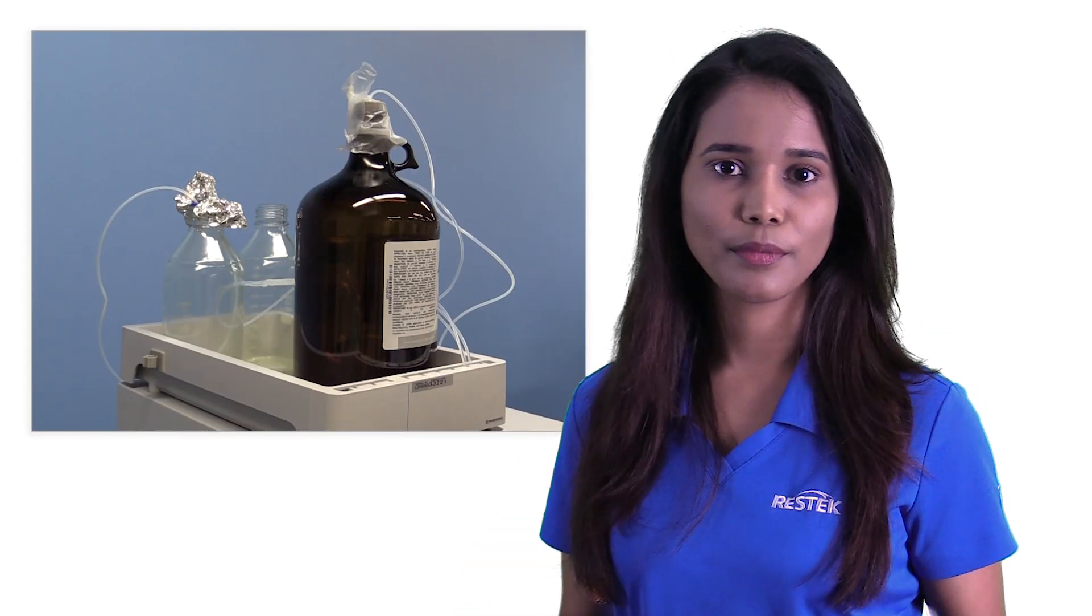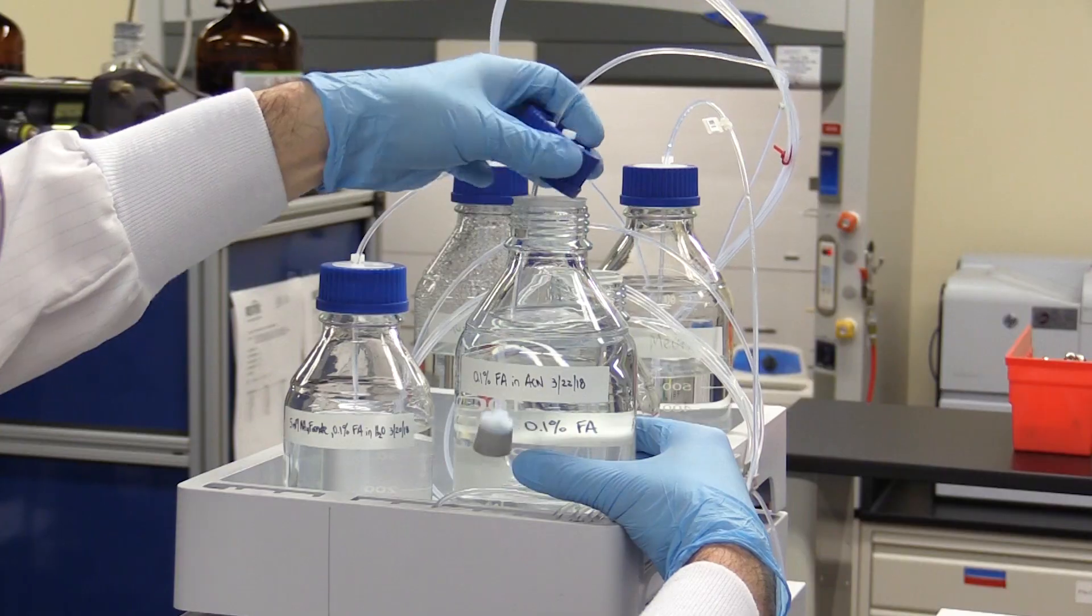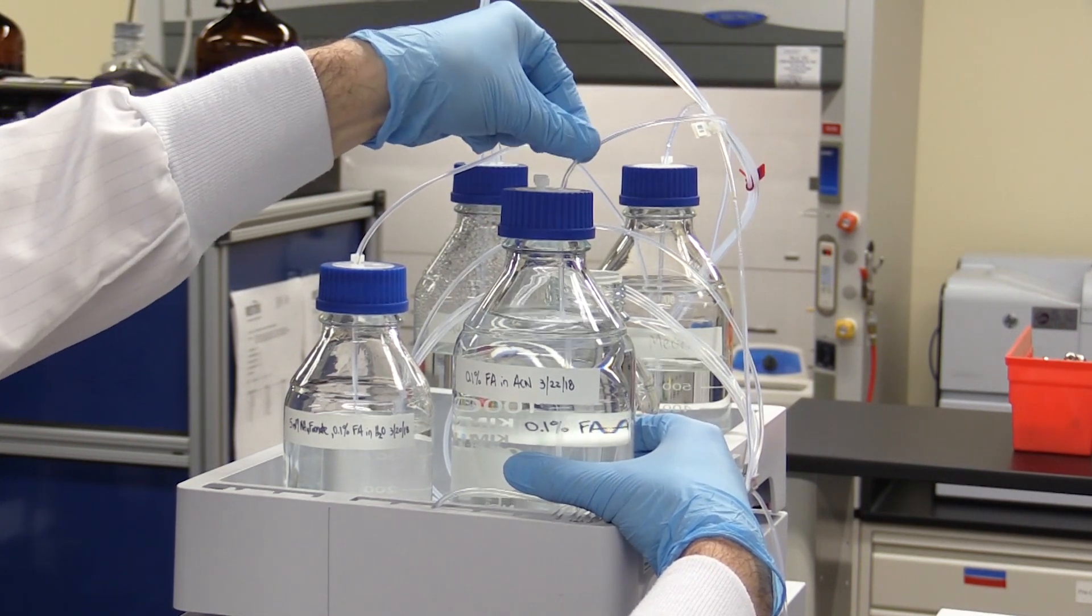Column clogging from mobile phase can occur due to bacterial growth in poorly maintained aqueous mobile phase bottles and precipitation of buffer salts. In all cases, mobile phases should be freshly prepared with HPLC-grade solvents and capped.